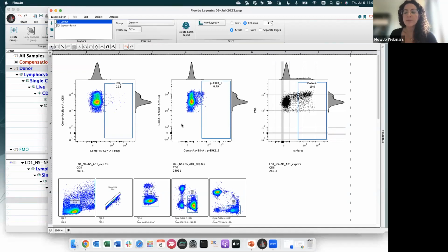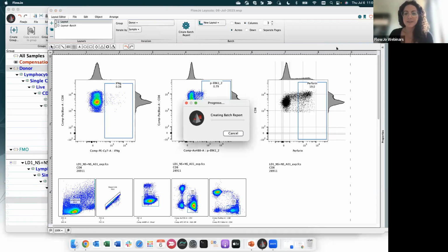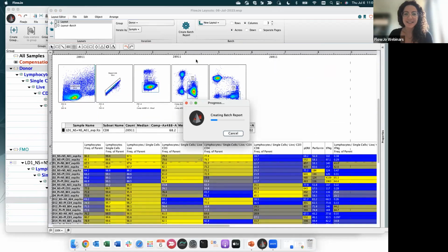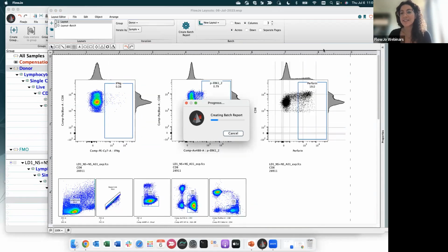Heat maps are not updated live, so it doesn't create a batch for the heat map. Want to try? Let's see. It should not create that. Indeed. It's taking time.